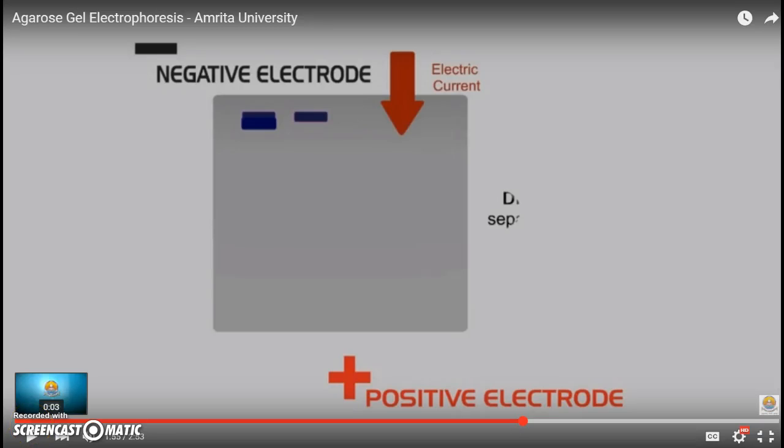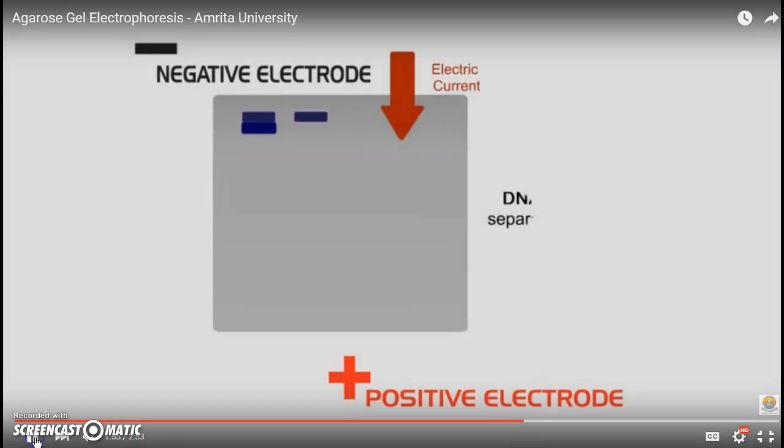Hi class, it's Miss Dunn here, and we left off class talking about gel electrophoresis. So I just want to play you this animation real quick that explains it. I'm just going to turn the sound off on it so I can talk over it.